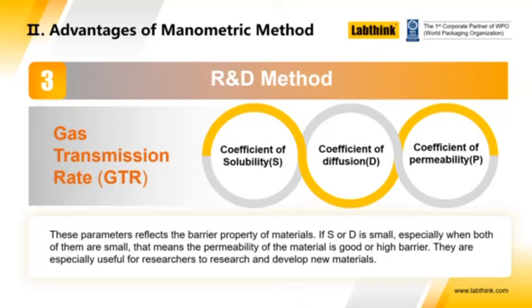So right at the very beginning, I mentioned to you that ASTM D1434 is the first standard for measuring gas permeability through different materials, and subsequently ASTM D3985 was developed. The reason it was developed was that, as you could see from the photograph I showed you, the apparatus is very crude and requires a lot of manual intervention from the operator and scientists who are running the testing.